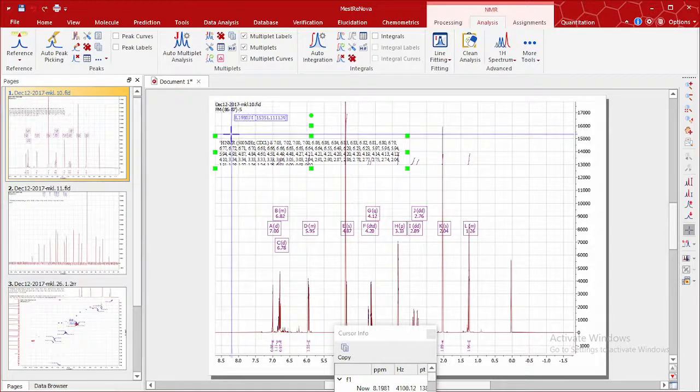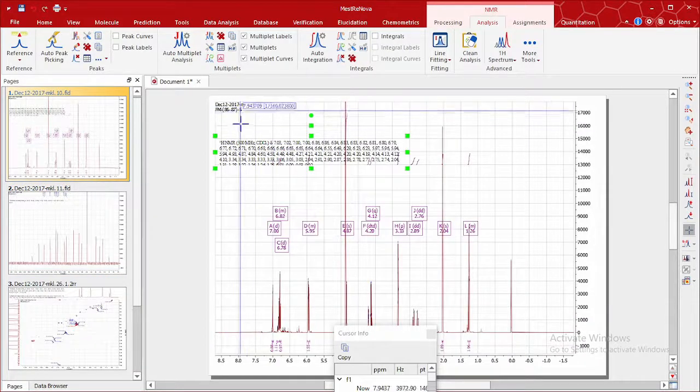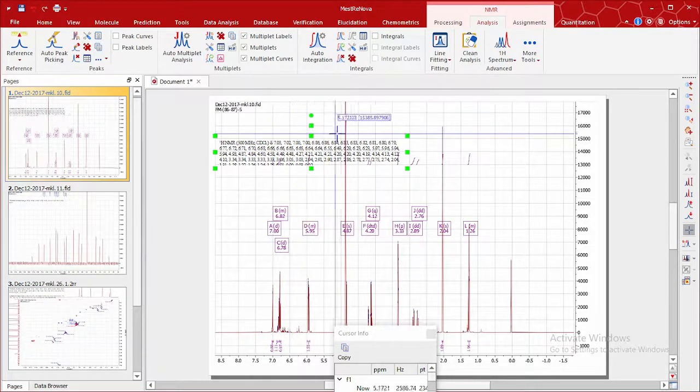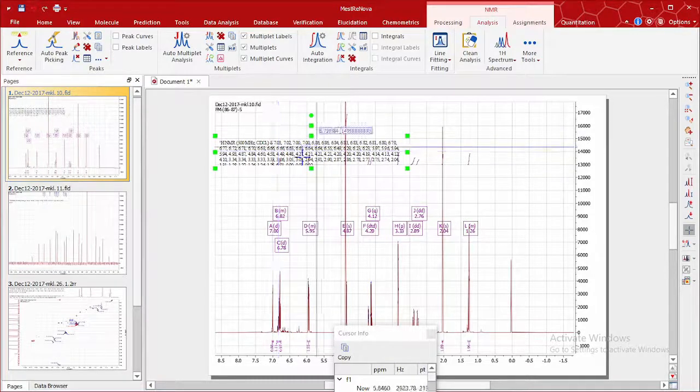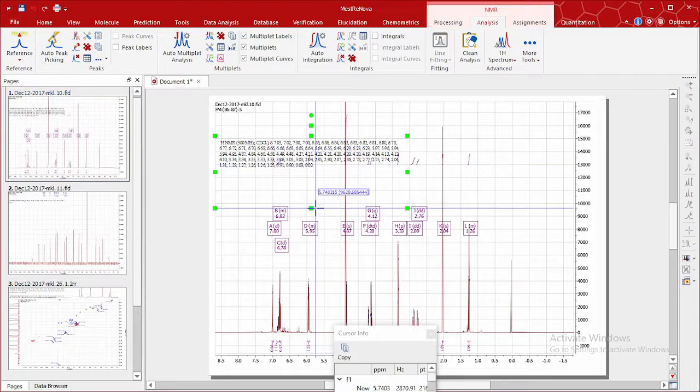So this is a Proton NMR report, and this is a carbon 13 NMR report. You can see the information there, as we said earlier: the capacity of the machine, the solvent used, which is chloroform, and it goes on to arrange your peaks in descending order of magnitude, starting from 7.0 to the last one, which is 0.02.